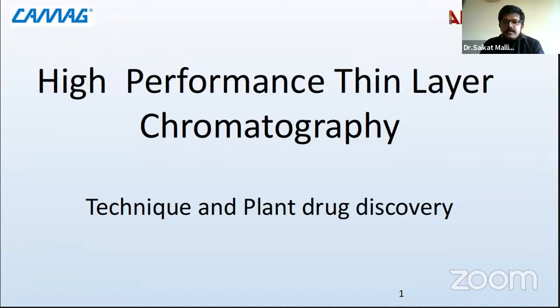So let's understand. We have previously met, and we had seen briefly what HPTLC is all about. As per my knowledge, during your graduation, you will be coming across TLC a lot of times, and you must be practicing it for your experiments. But HPTLC is a totally different subject. In layman's language, what column chromatography is to HPLC, the same way TLC and HPTLC are quite different in approach. And the quality of results which you get on HPTLC is very high, similar to any other chromatographic technique, which is very different from the basic aspect of analysis.